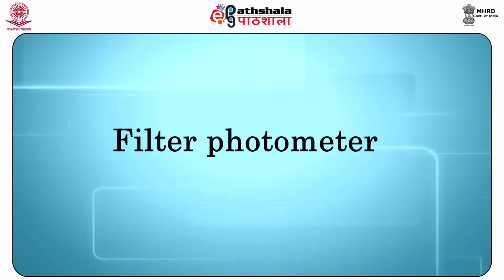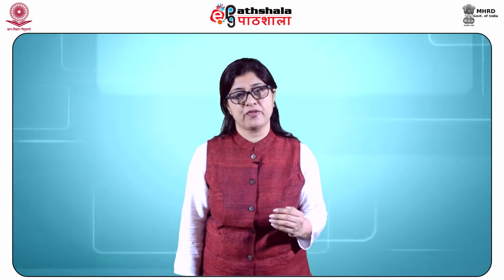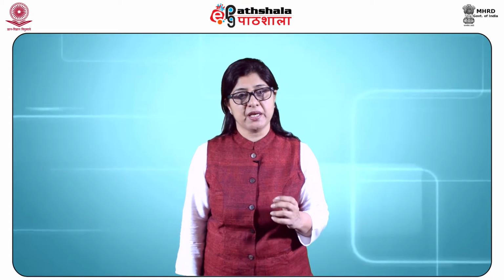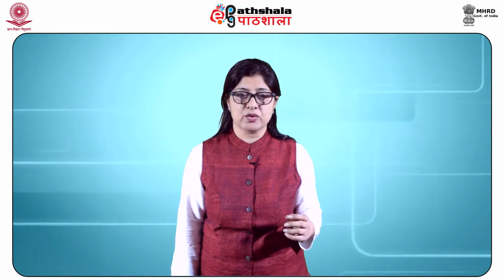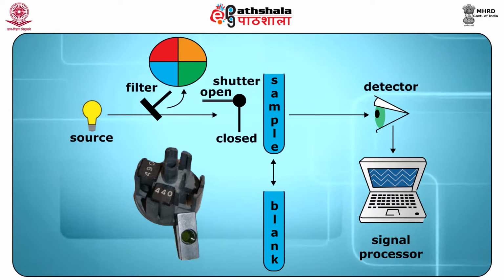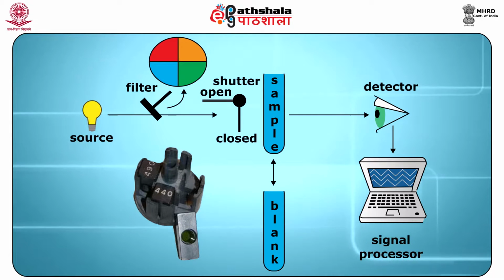The various kinds of spectrophotometers are hereby described. A filter photometer. The filter photometer is the simplest instrument for molecular UV absorption spectroscopy. This instrument has been named so as it uses a filter to isolate a radiation of a particular wavelength under which the study is required. The filter is positioned between the source and the sample.